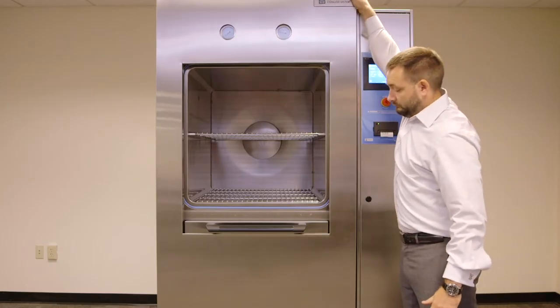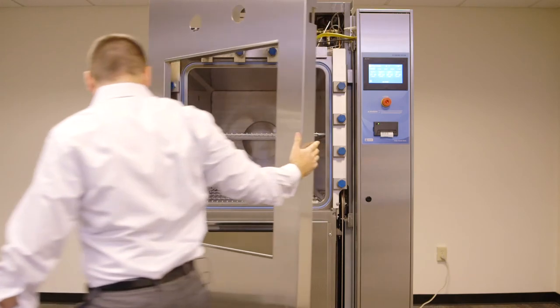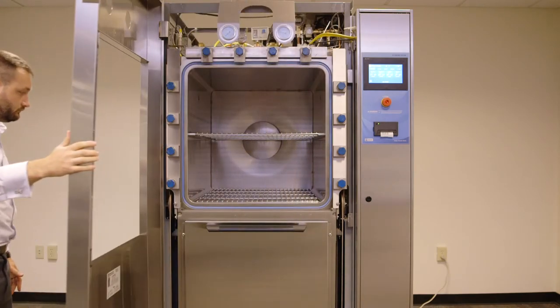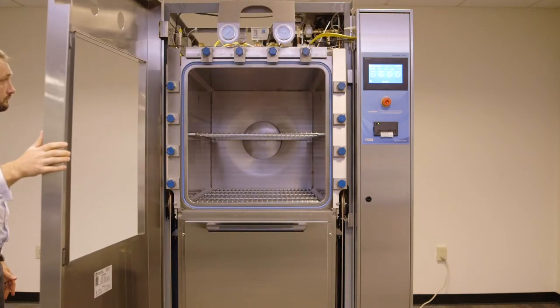The vertical sliding door autoclave's hinged front panel makes it easy to access internal components from the front, thereby reducing service space.